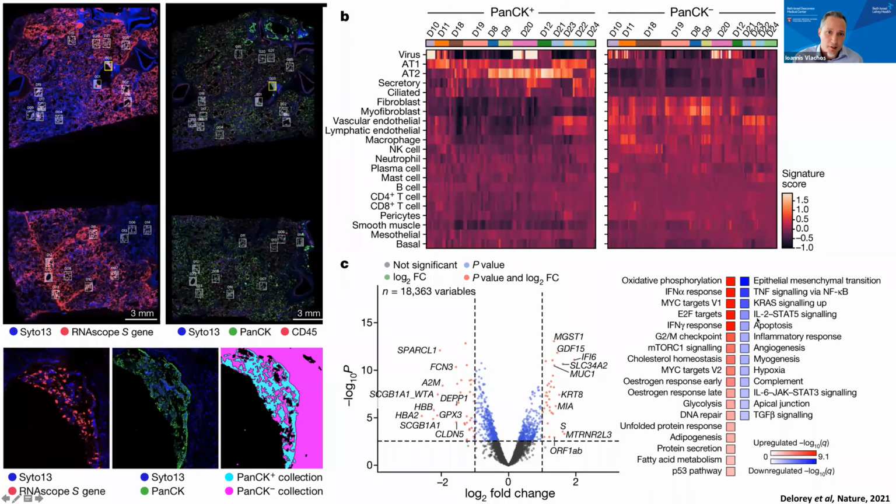Sami Farhi's team at the Broad used the GeoMx platform, and they followed the region of interest strategy based on pan-cytokeratin signal. So the selection and comparison between CK plus and CK minus regions really helped identify not only differentially expressed genes and the transcriptional programs that dictate these regions, but also, by combining it with concordant single cell / single nucleus data, you could identify which cell types and abundances per patient are there.